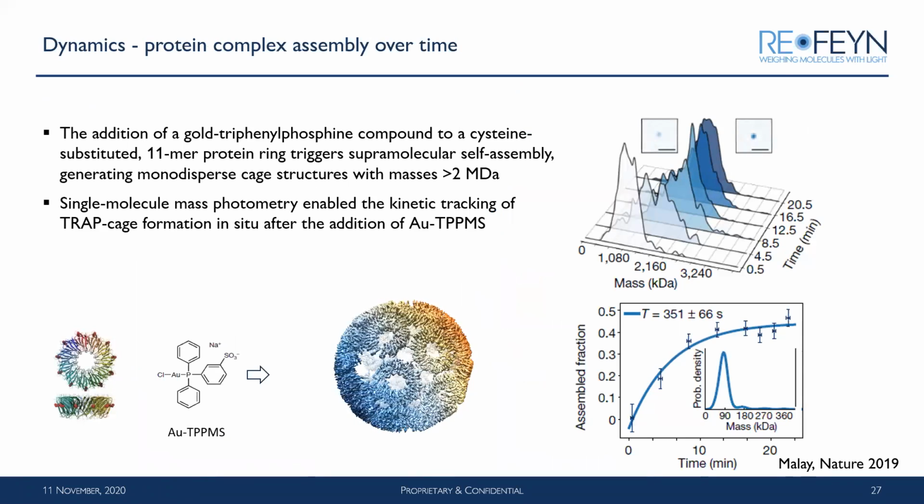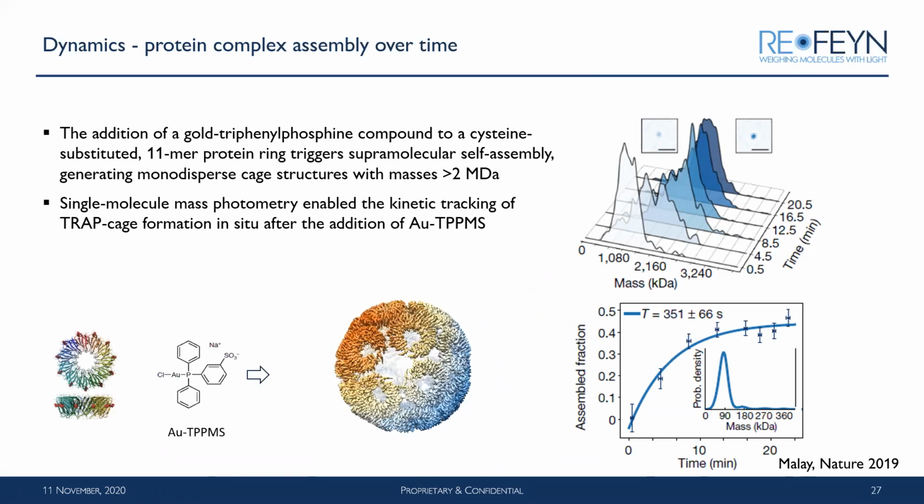So the last example that I want to give you is the dynamics, which here is an example of protein complex assembly over time.